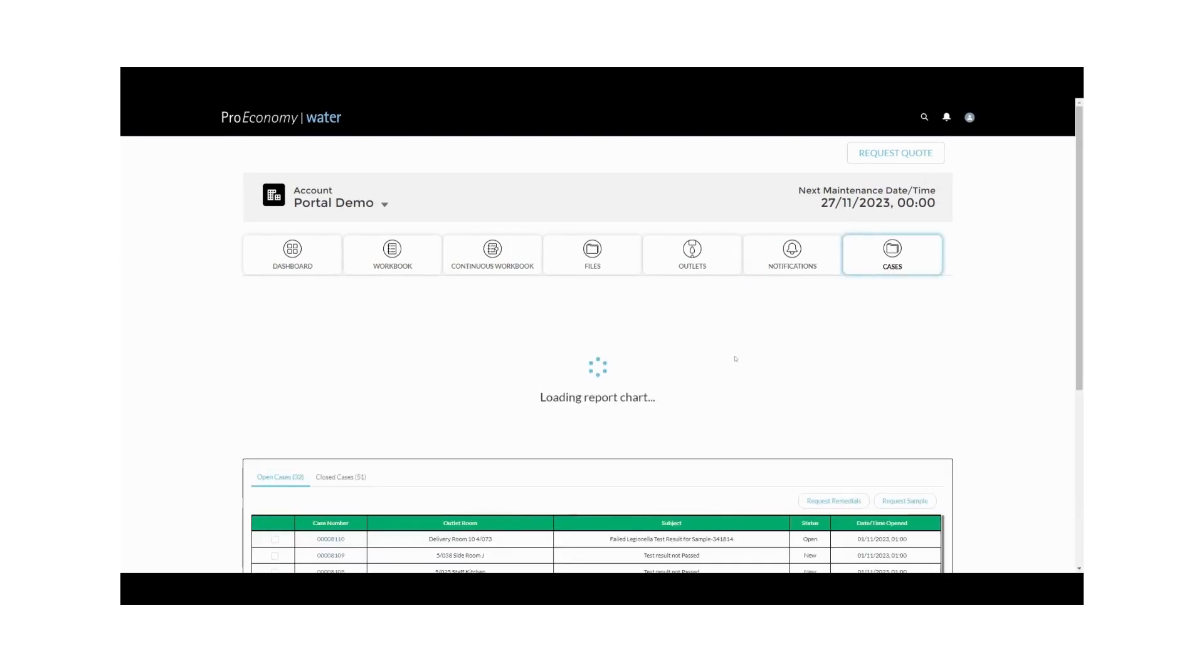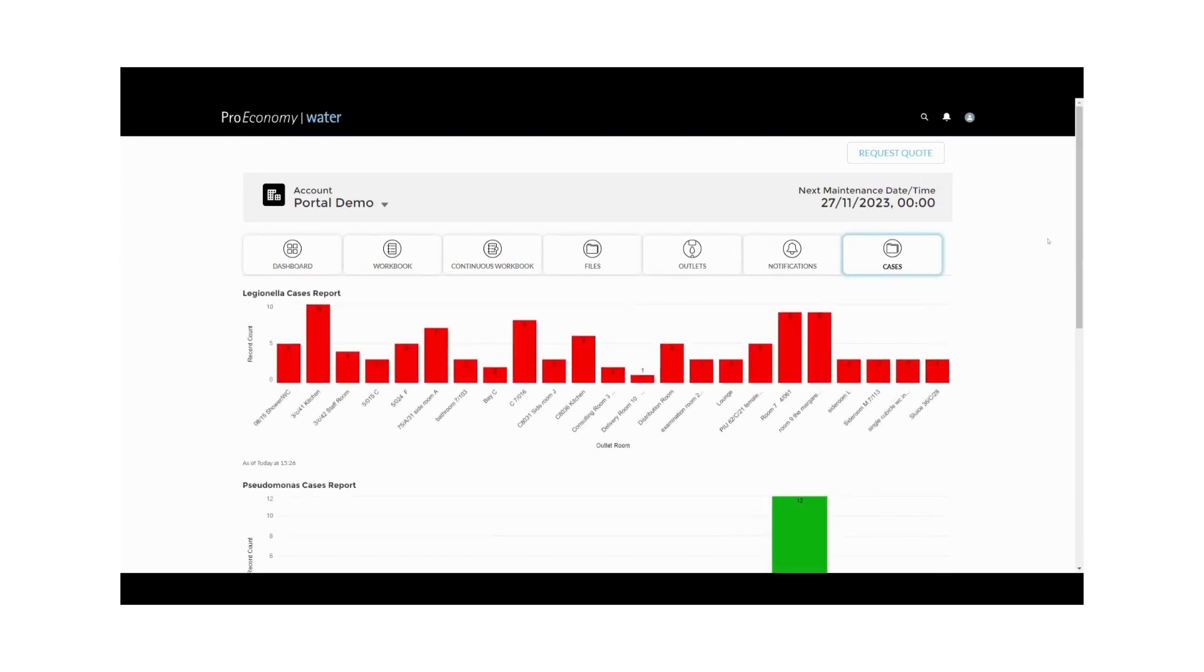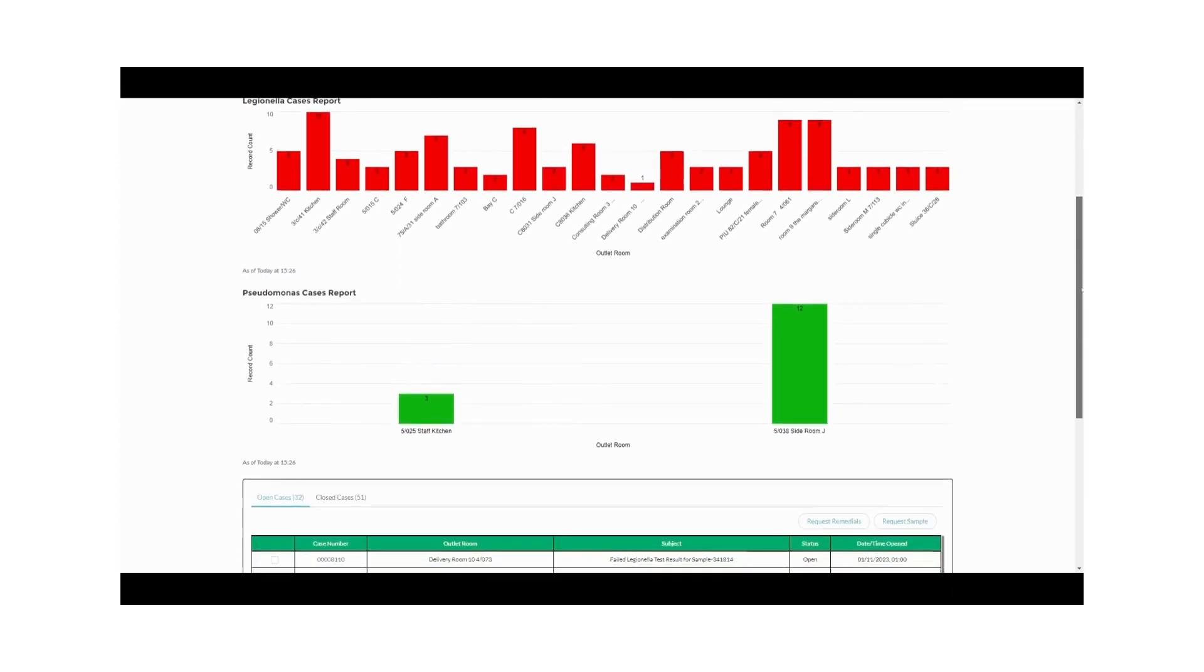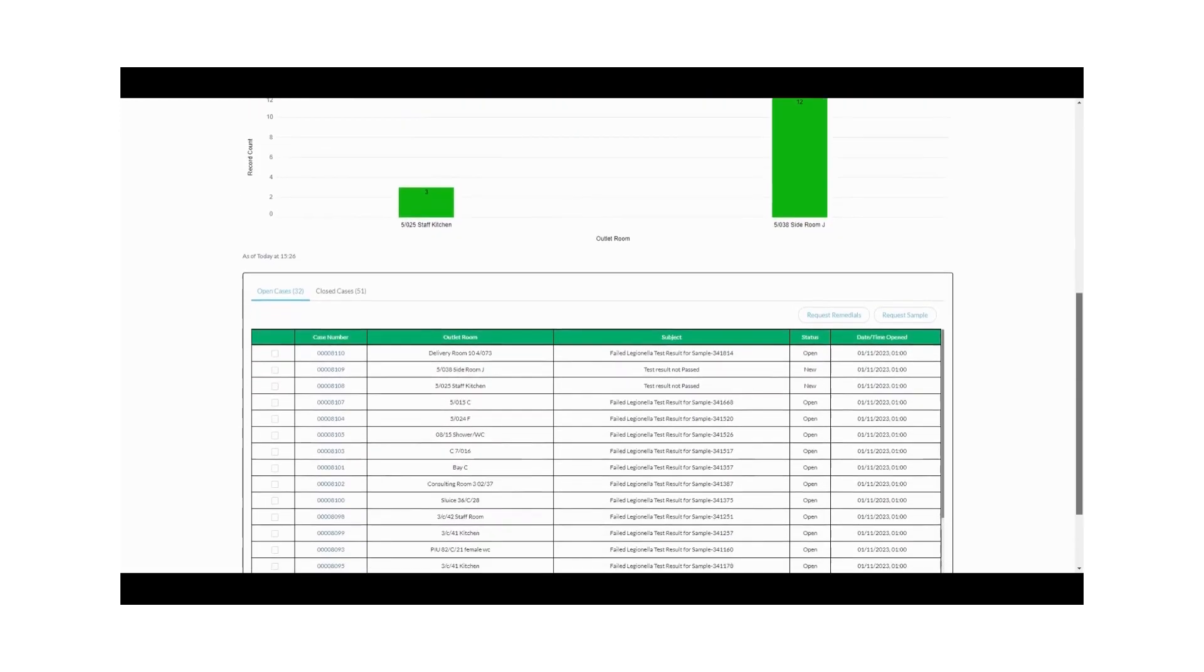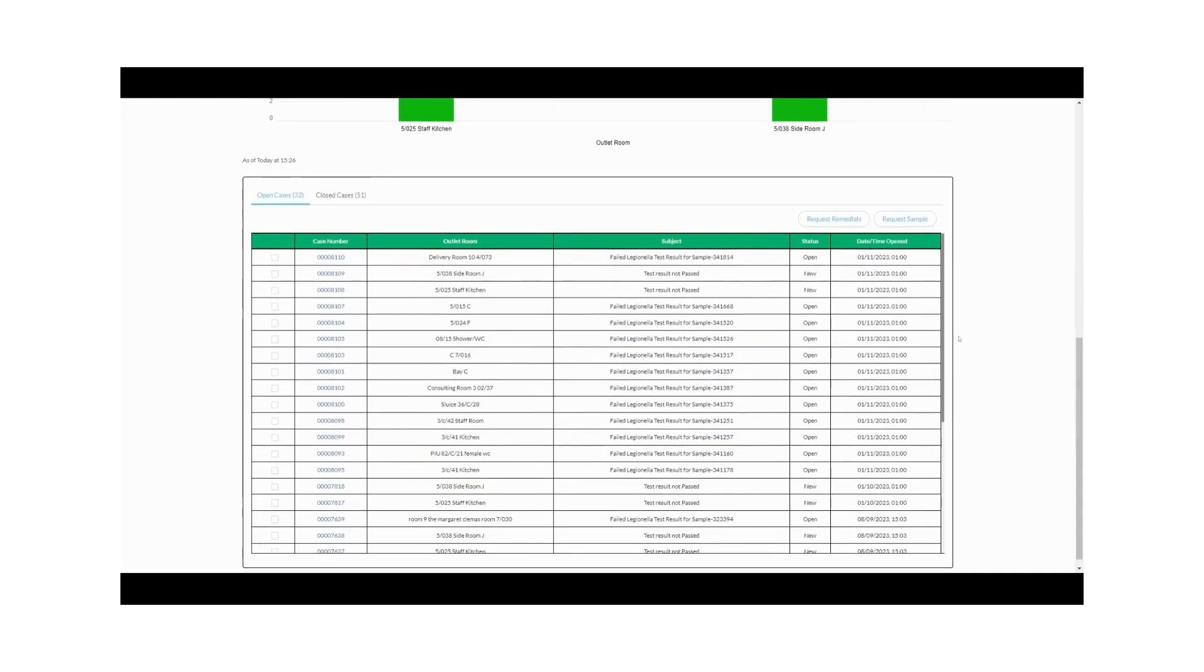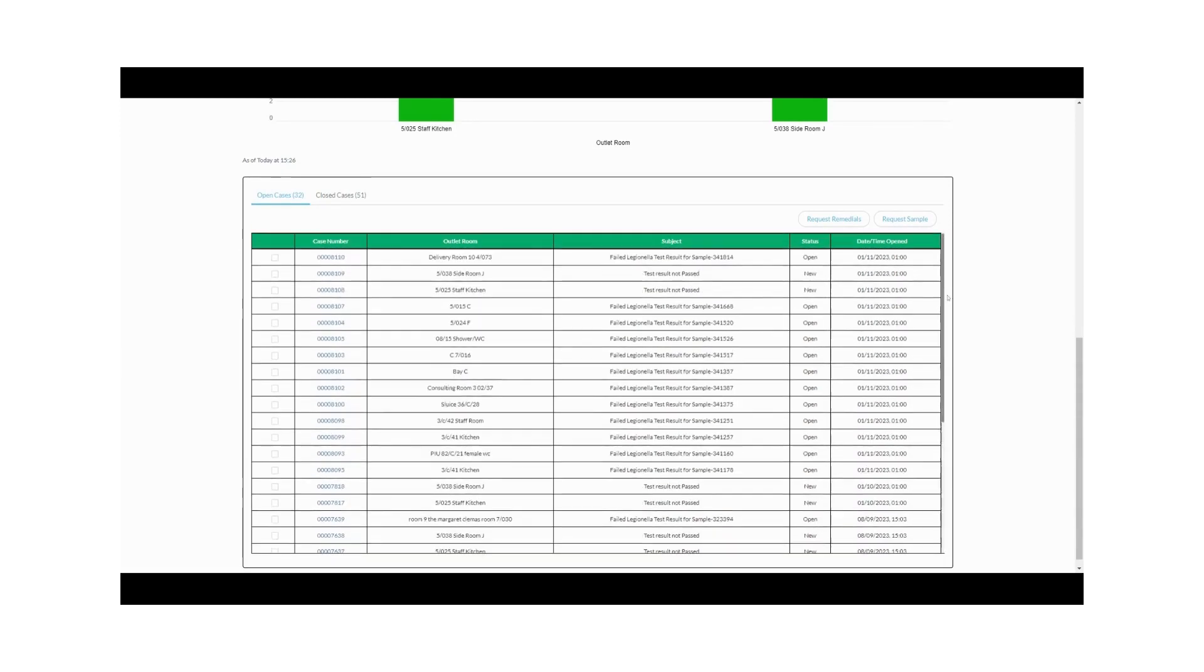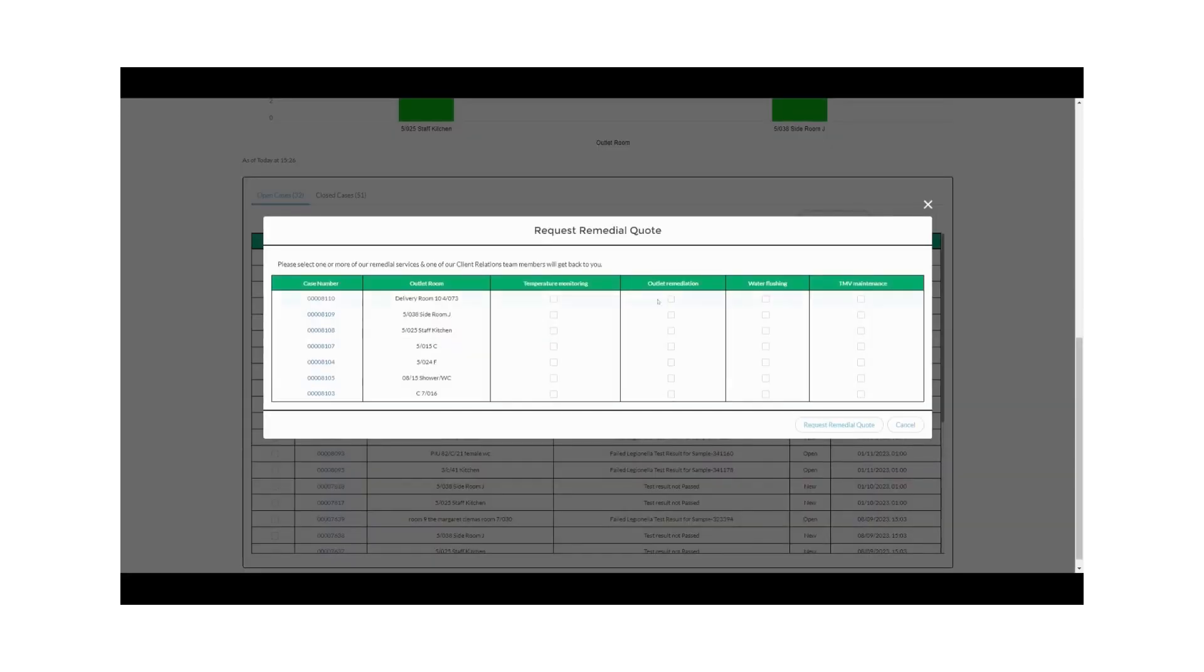In the Cases tab, you'll find a record of open and closed cases of Legionella and Pseudomonas. This is linked to our outlet database, so you can initiate remedial actions and re-sample requests directly from this page, ensuring timely responses to water quality issues.